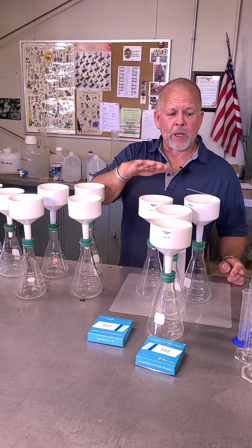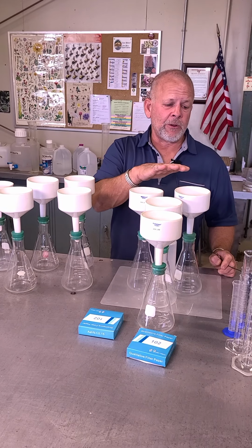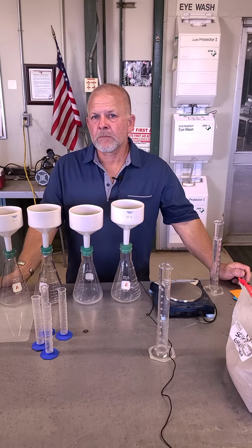We're going to pause here and put the rest of them in. And then once we get these all loaded up for run 1, I'll explain what's next.